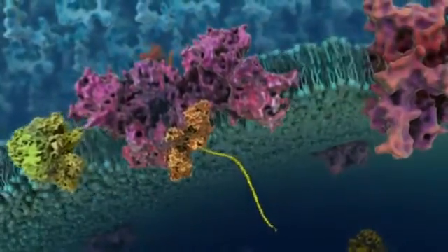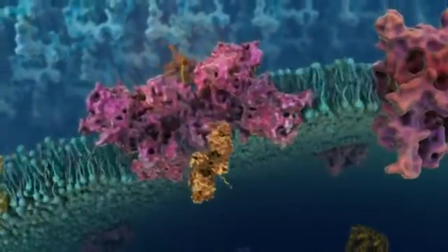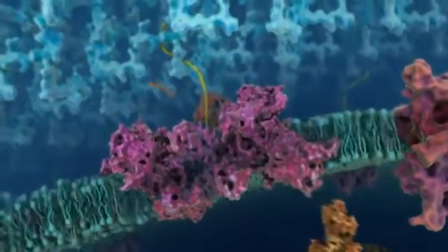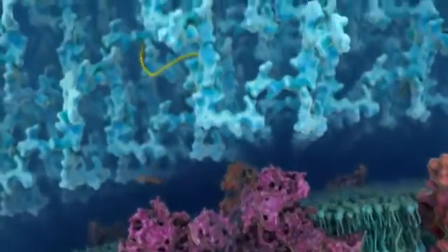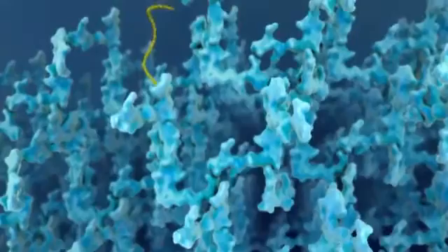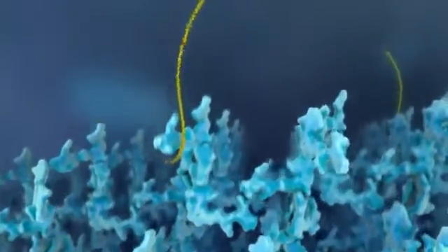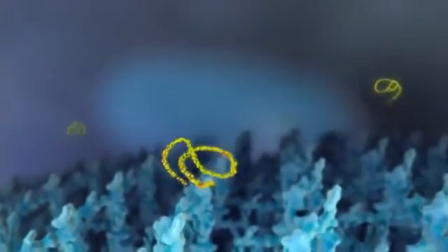The signal peptide is recognized by the SEC translocase and initiates protein secretion. As the leader signal peptide reaches the outside of the cell, it is cleaved by the membrane-bound peptidase, and the remaining protein is secreted and subsequently folds in the media.